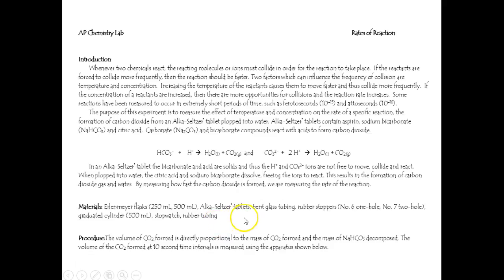So given this material, we're going to determine that the volume of carbon dioxide formed is directly proportional to the mass of carbon dioxide formed. I guess that's true. Mass of CO2 formed, interesting. And the mass of the bicarbonate that's decomposed. The volume of the CO2 formed at 10-second time intervals is measured using the apparatus shown on the next page.